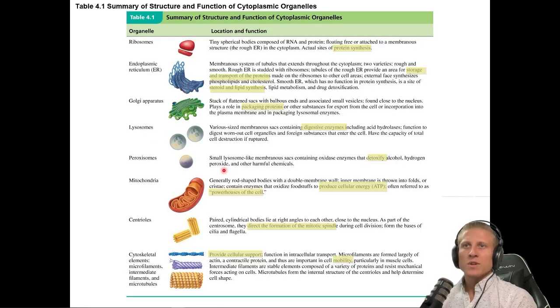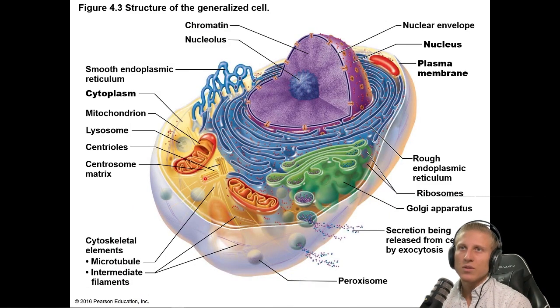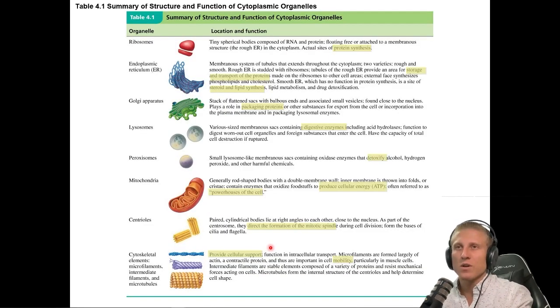And lastly, we have some cytoskeletal elements that we see listed here. Just note that that is what these are right here. We're not going to go any further than that. Again, this is anatomy and physio, not a cellular biology class.